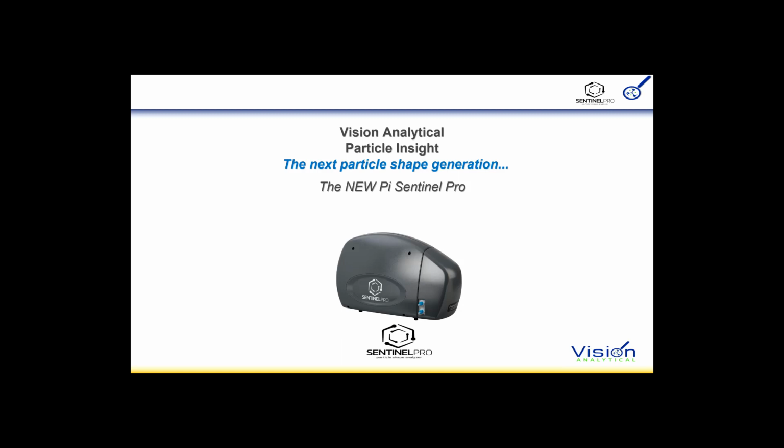Vision Analytical has introduced two new particle shape instruments known as the Sentinel Pro and Particle Insight. It has new features that are significant. A new light source has been added that allows better resolution for small particles. Optics have been improved so we can see 1 micron diameter particles as well as 1 micron particle shapes.